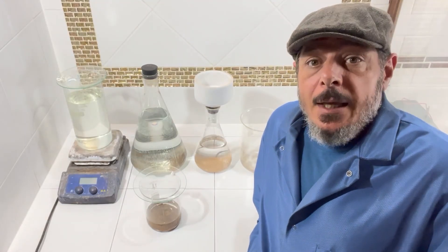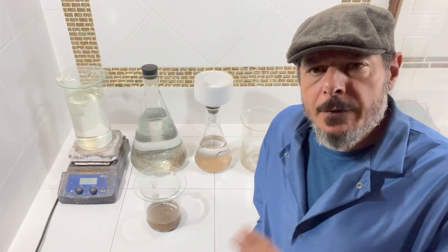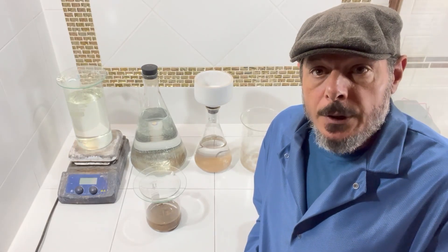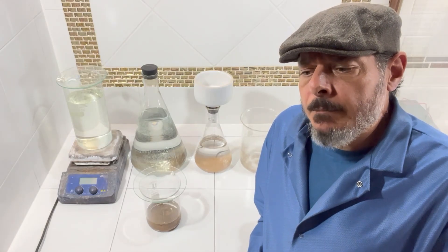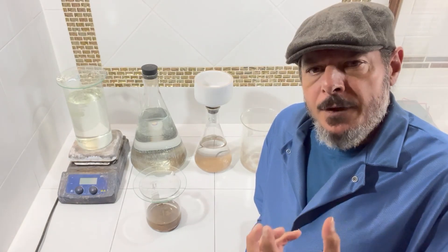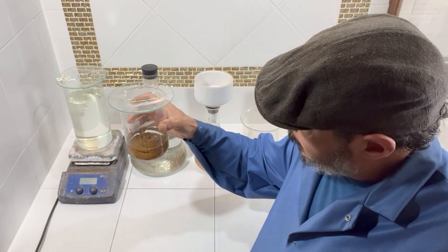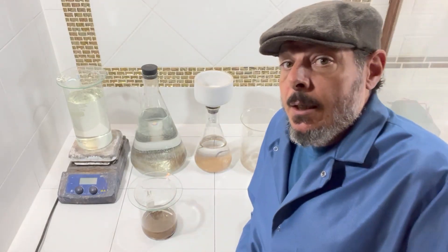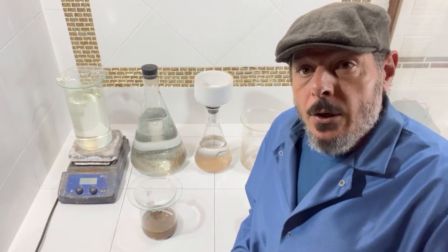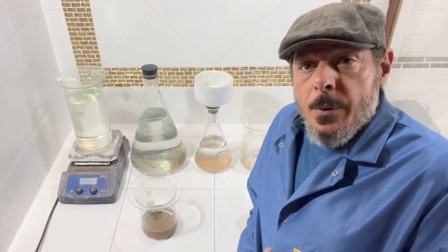Welcome brothers and sisters. In this experiment we're going to talk all about gold, but I don't want to go over gold the same approach as what's already out there on inquartation, dissolving with nitric, and then dissolving your gold with aqua regia. I want to talk about a few different things - how to get good at the process. The first thing you'll need to think about is that fear we all have when we take $7,000 worth of gold, dissolve it in acid, and light it on fire. I want to show you what to do in case you run into the worst-case scenario and how you can get yourself out of that problem fast and right back to refining.